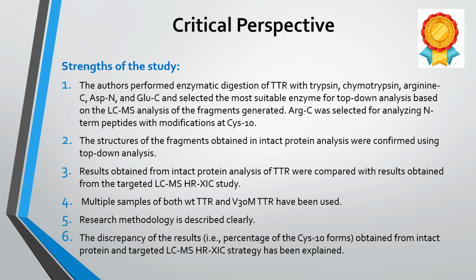Fifth, the article is well written and the research methodology is clearly described, providing sufficient details so that other researchers can use the methods while performing similar studies. Sixth, the authors clearly explained the discrepancy in the quantitative results, for example, the percentage of the modification present in the TTRs obtained from the intact protein and targeted LC-MS high-resolution extracted ion strategy.